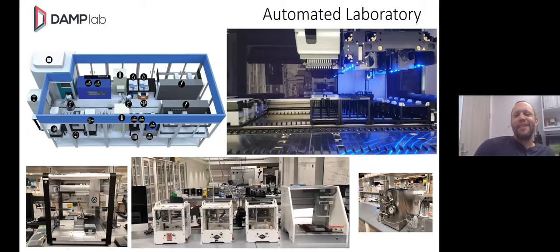So something I'll talk a little bit about is what we might do after COVID is over and our robotics are no longer doing RT-qPCR, but maybe will be available to people like the GBA. So again, you can think of the damp lab as a place that's going to have robotics expertise and is going to help prototype and develop some of these things that could be disseminated to the community.